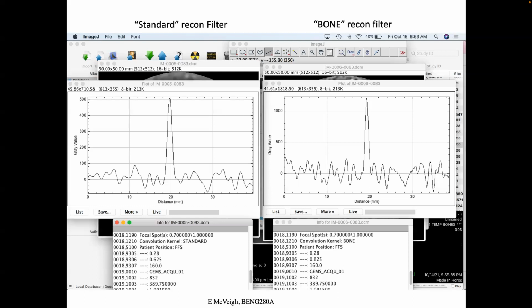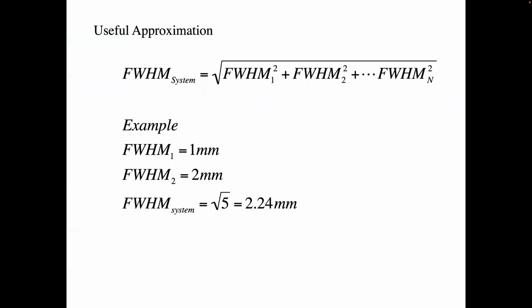And in microscopy done in live cells with fluorescence, in some of these super resolution techniques, they set the rate of emission of signal such that they get individual fluorescent events. Then you can stack them in time and get this blob, and you know exactly where that thing is, and it didn't interfere with the stuff around it. If you get a lot of signals coming in simultaneously, they're all going to mix together and you can't see it. But anyway, that's super resolution.